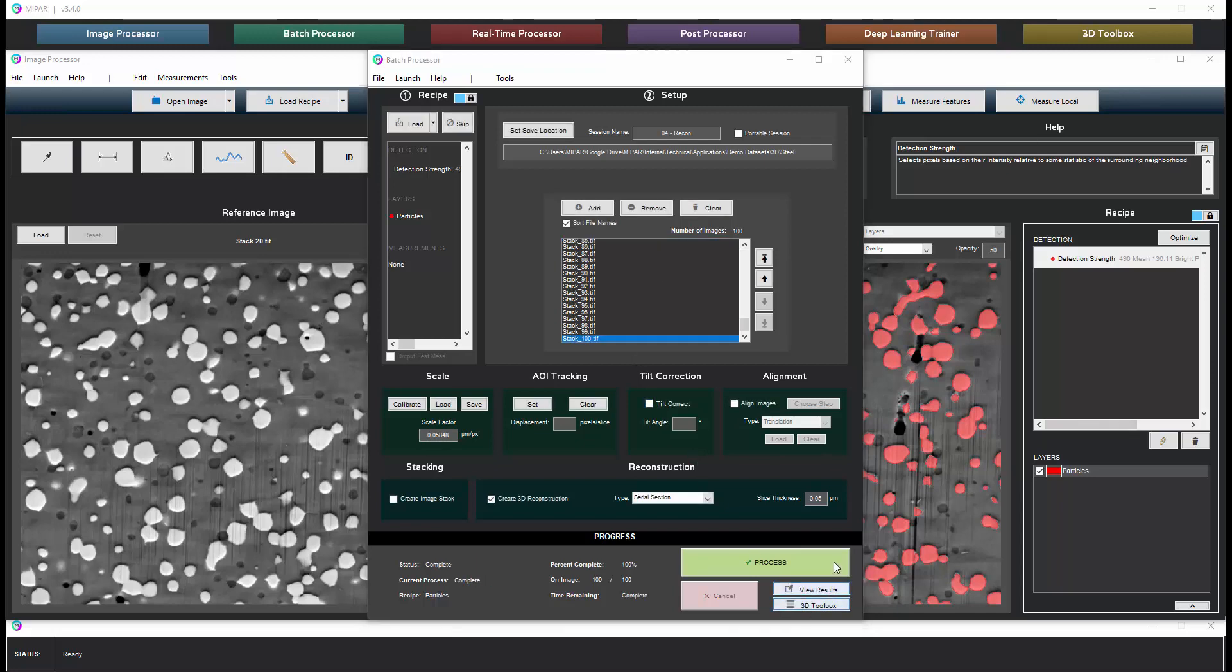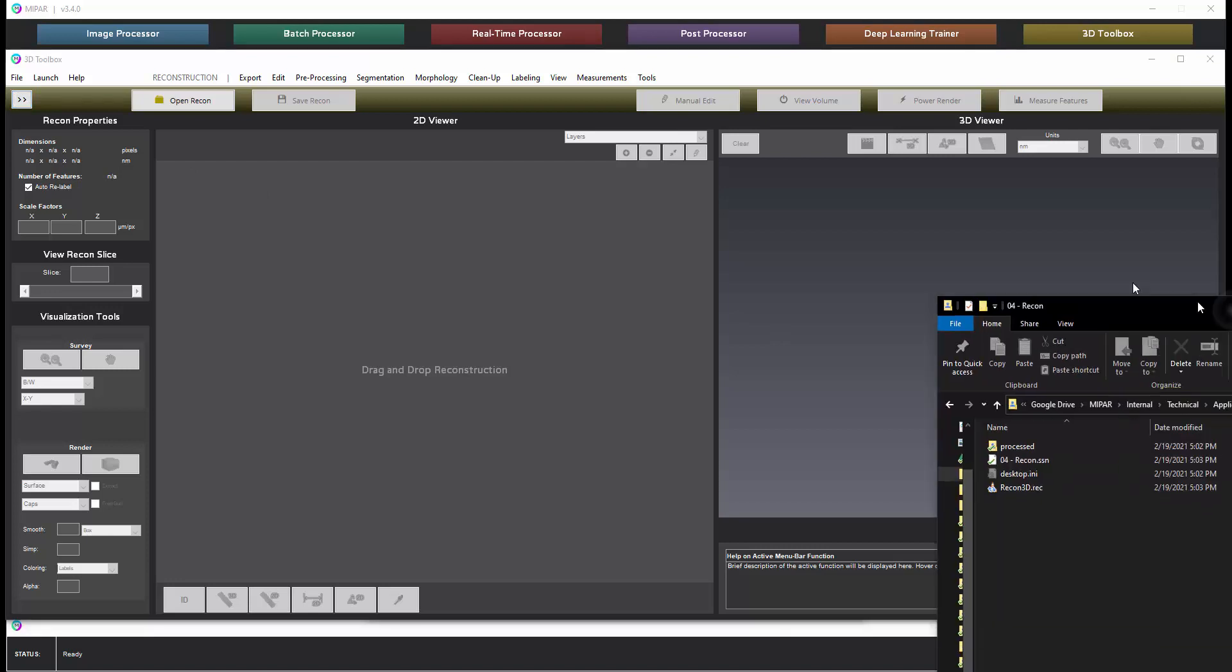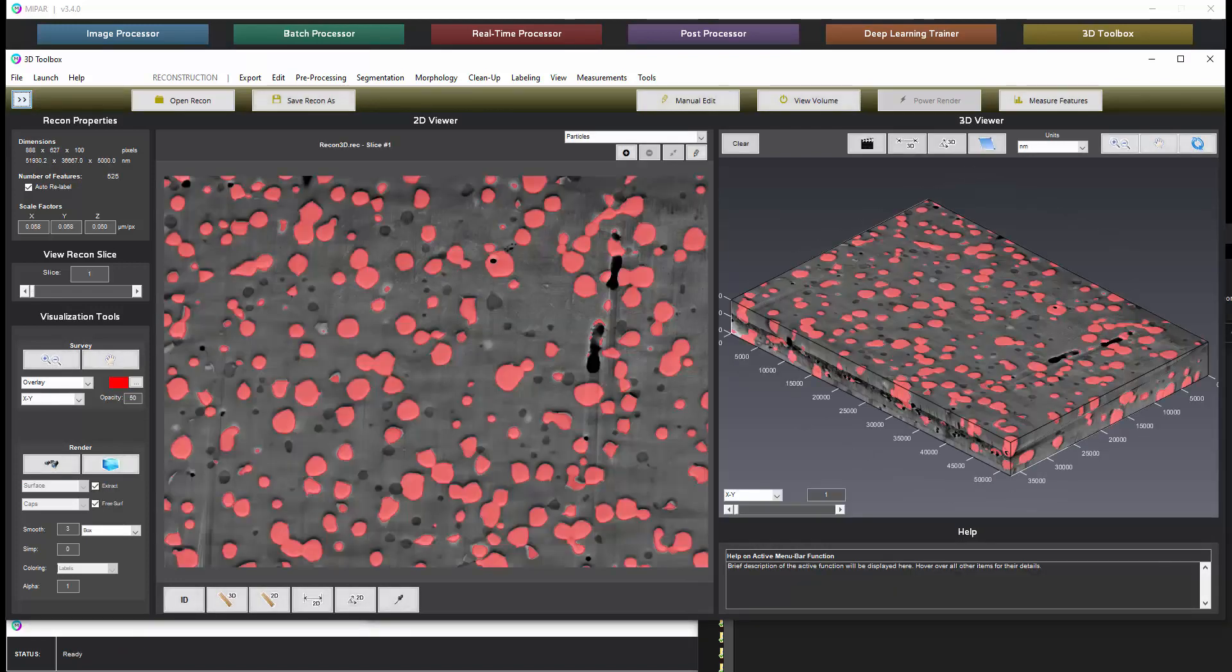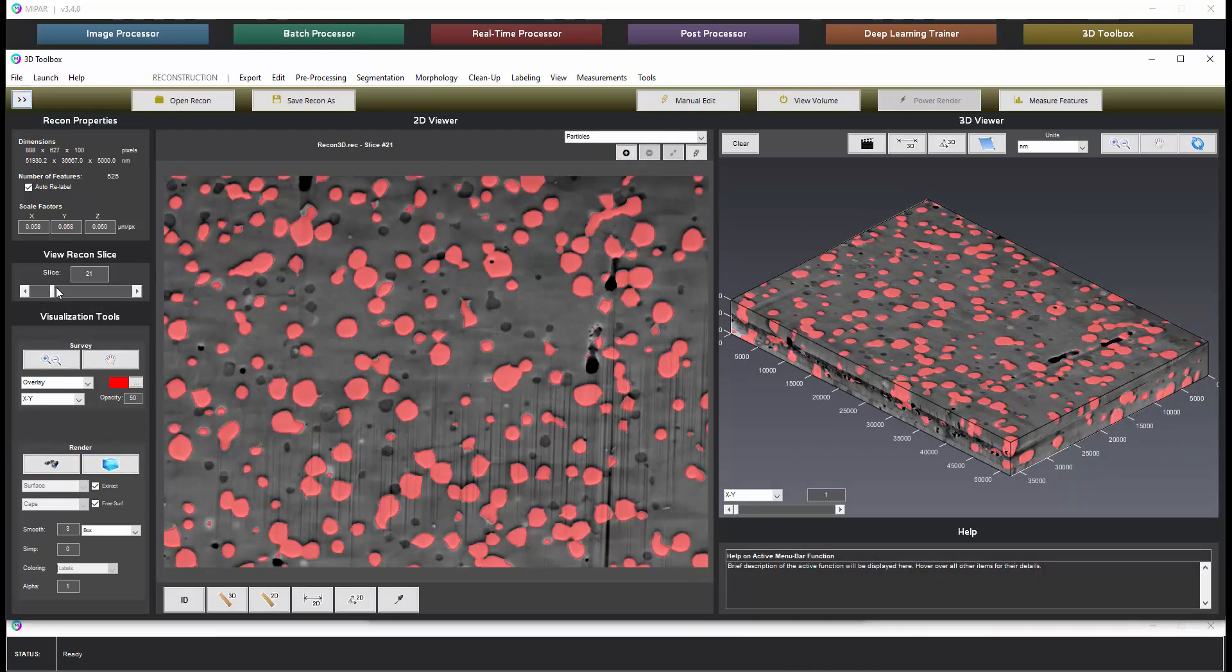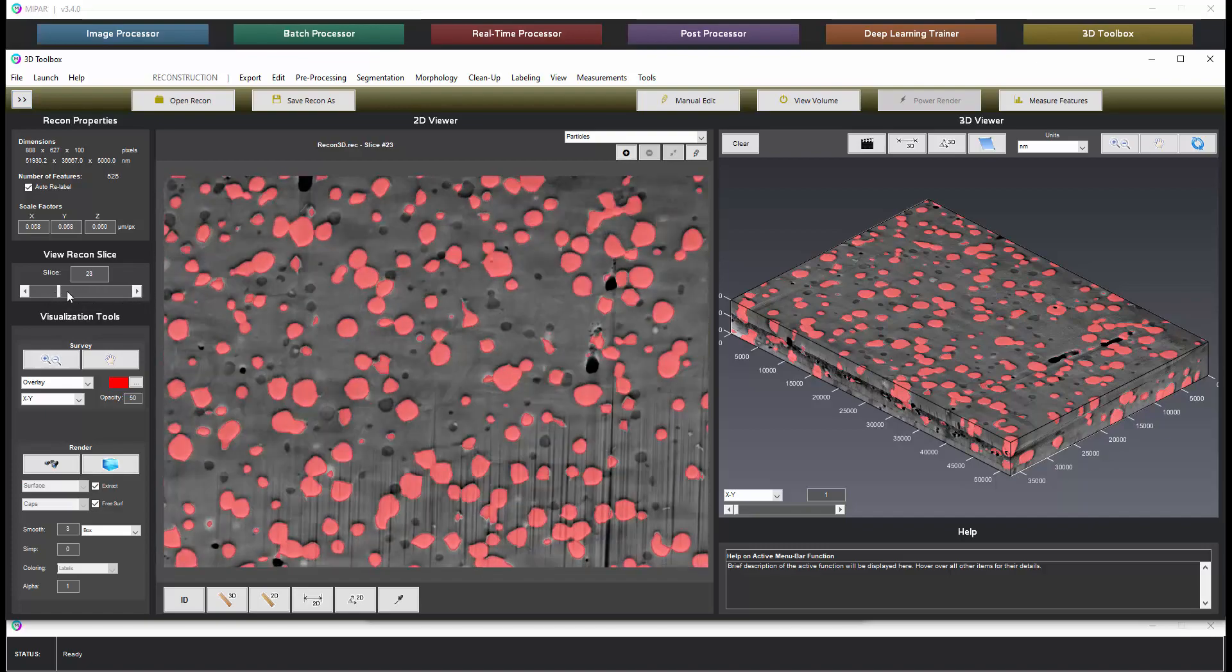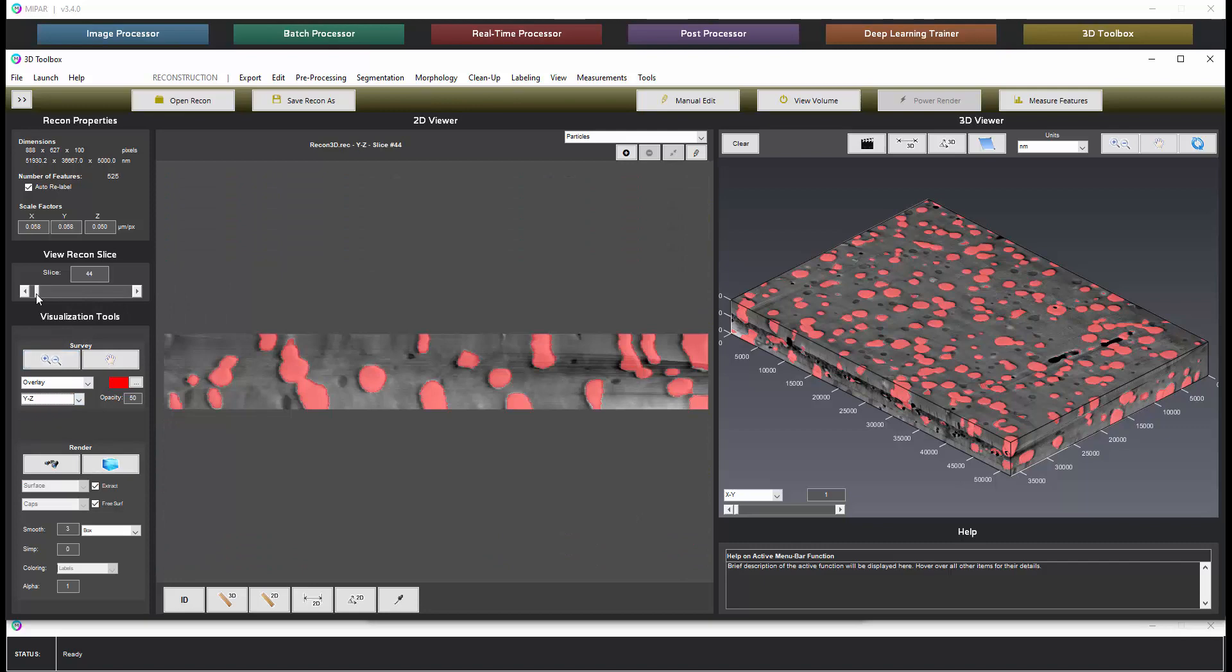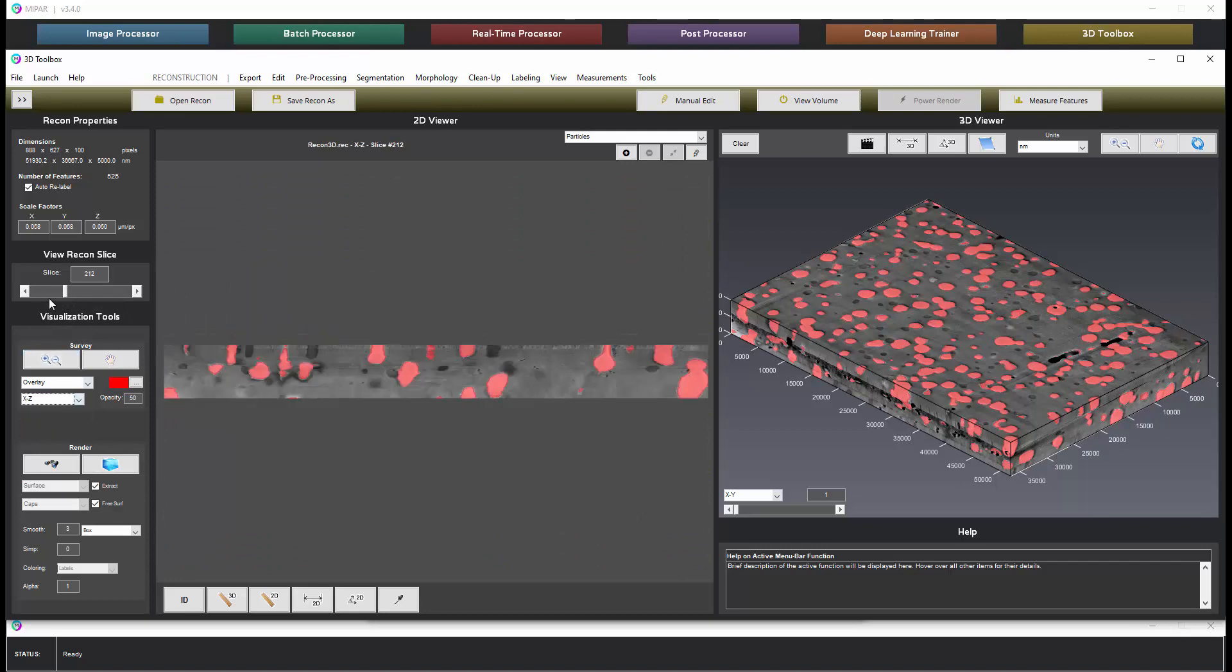Once the batch is done we can go back to the 3D toolbox to review the reconstruction. Now we can hide the image stack controls and we'll drag in the recon file that was output. So we can slide through these slices. Here's the XY slicing. We can slice from the YZ view or the XZ view.